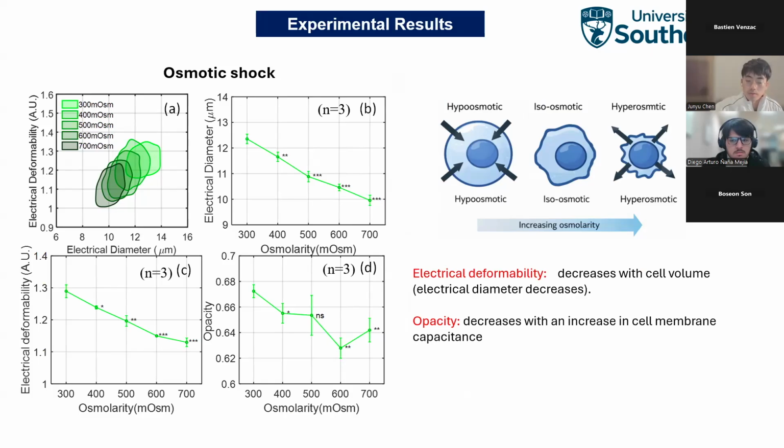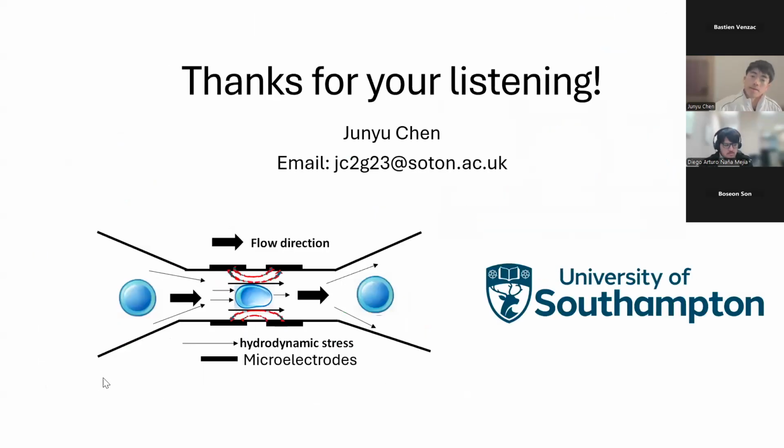So all these results demonstrate that the system can sensitively detect the change in both the mechanical and the electrical properties under different conditions. So here, I have demonstrated a microscope shear flow cytometry platform to enable us to simultaneously measure single cells. Yes, thanks for your listening.